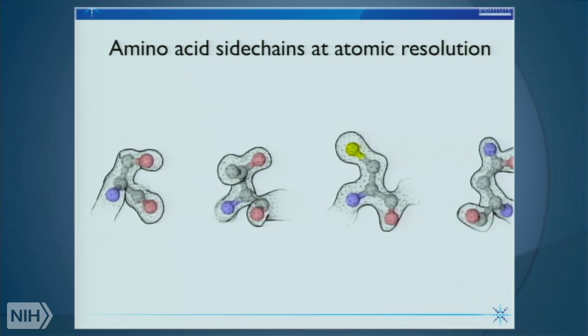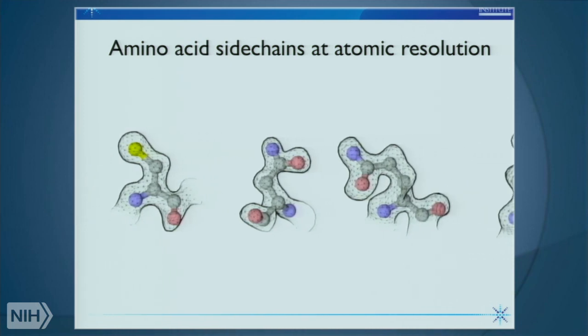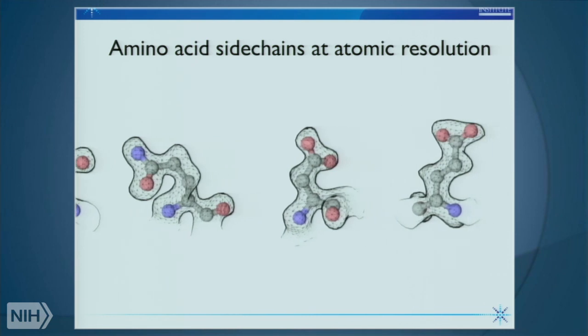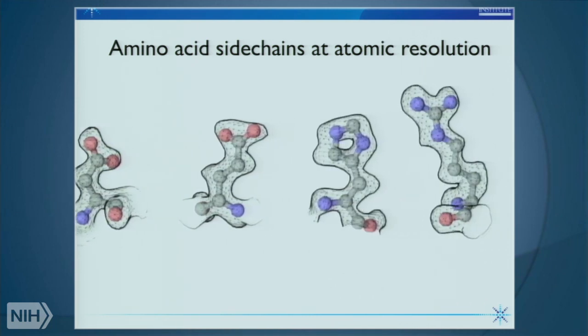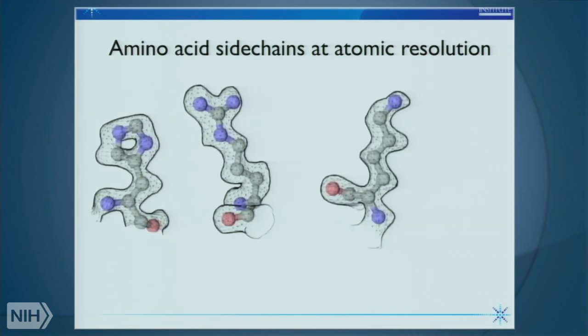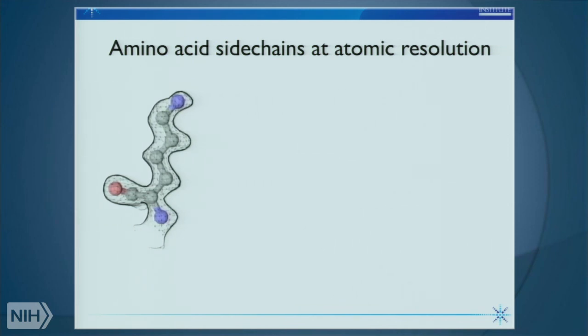You can see slightly larger densities for sulfur atoms, and even for negatively charged residues, where previously at higher doses we lost density in the carboxylate moiety. Now in many cases we can recover density at these terminal moieties. And finally, for long-chain amino acids such as arginines and lysines, we can still see density all the way out to the end, suggesting they're reasonably well ordered.